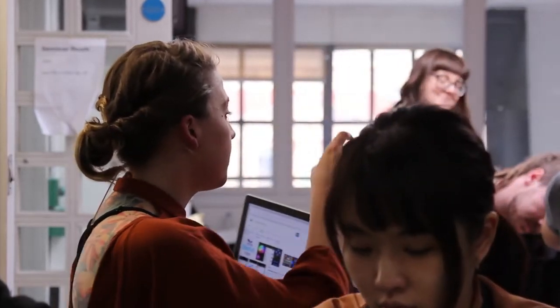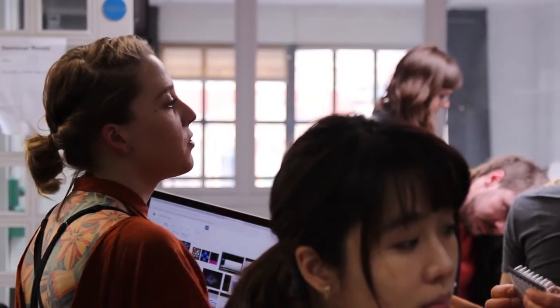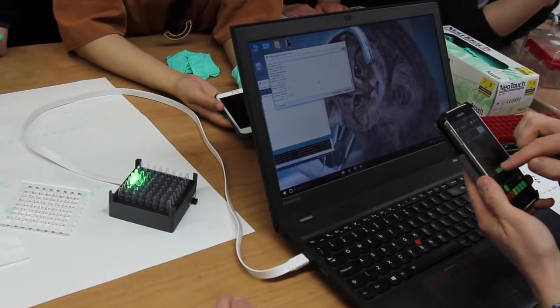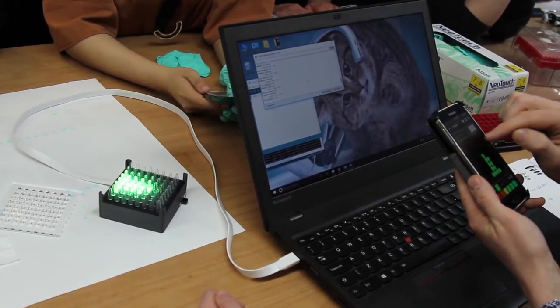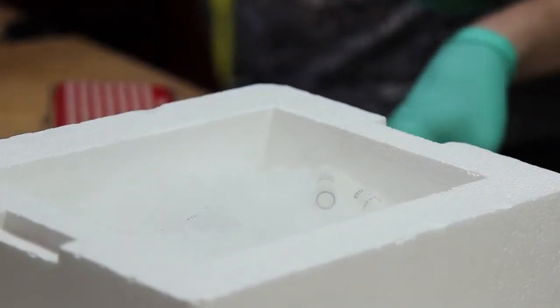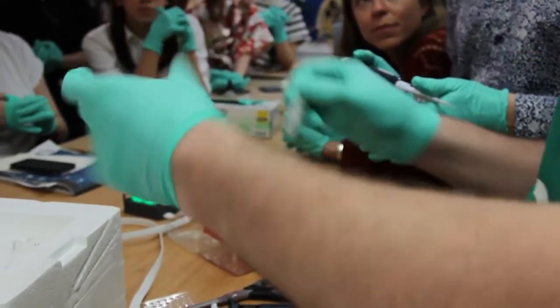We will create two different 8x8 pixel pictures and stream to the world with our BioPixels. You can play around with this little device to design in the matrix the picture you think is the coolest. We're going green and black today — black means we don't have a reaction at all, and green represents GFP, the jellyfish protein Tom was talking about. This is literally just circularized DNA, which is called a plasmid — it's just a closed loop.